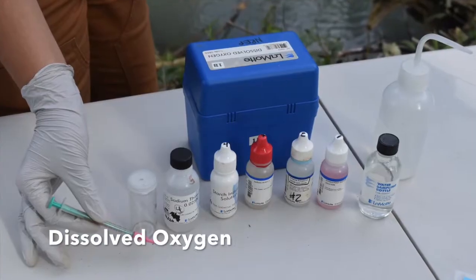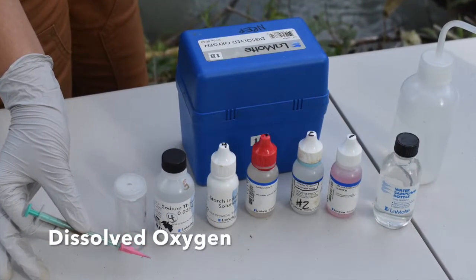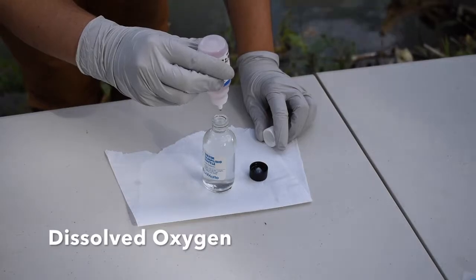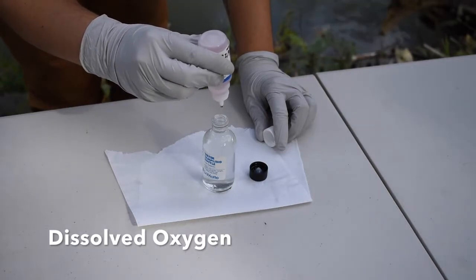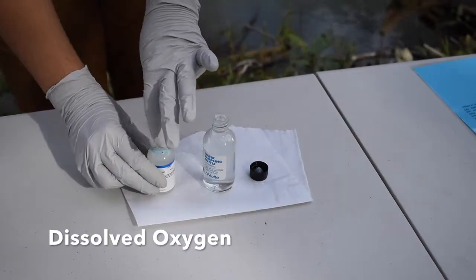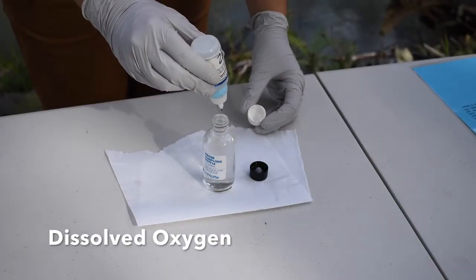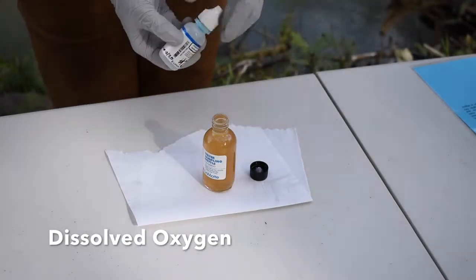Here are all of the materials you will need to test dissolved oxygen. First, we will add 8 drops of chemical number 1, manganese sulfate, followed by 8 drops of chemical number 2, alkaline potassium iodide.